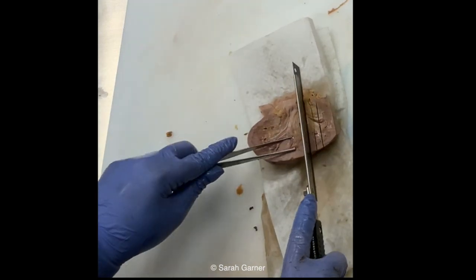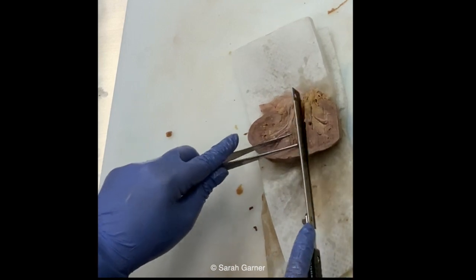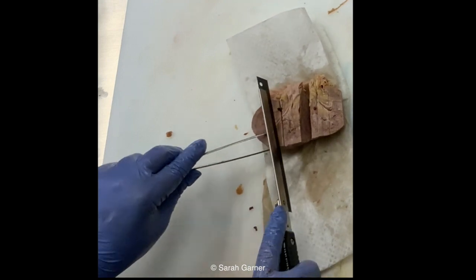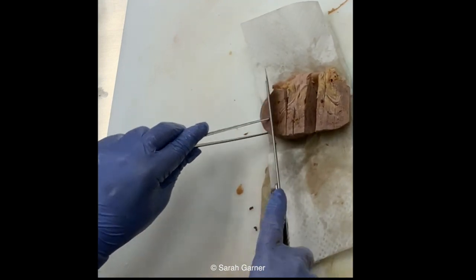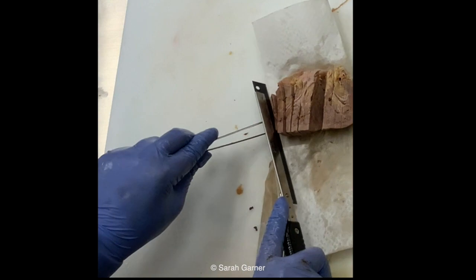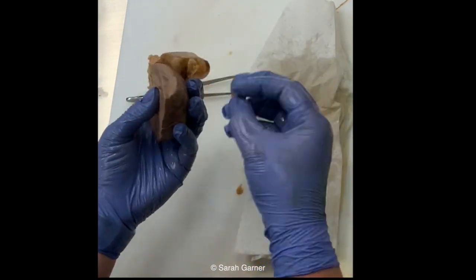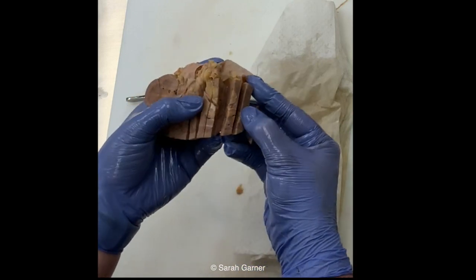You should always use forceps. I'm being a bad example. So basically same thing over here. We're just cutting through it, and cutting through that renal pelvis hurts me because I think kidneys are really pretty. They're one of my favorite organs. And so cutting through it all just upsets me, but you got to, because you got to see the cut surface, right?